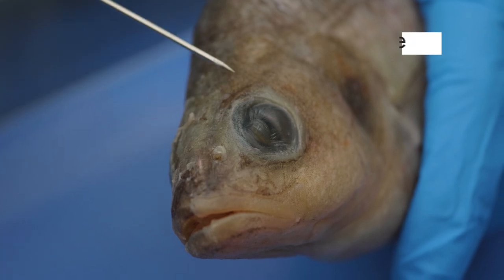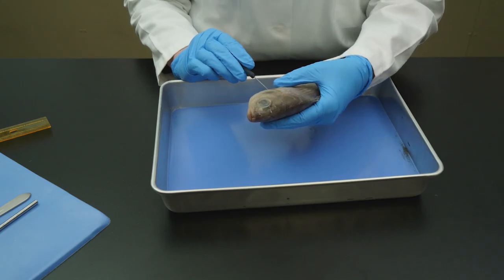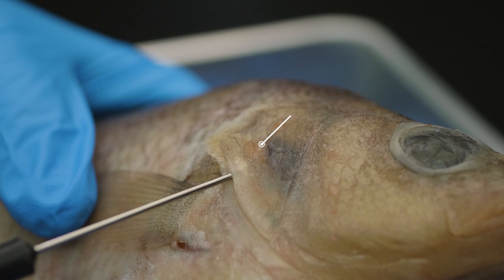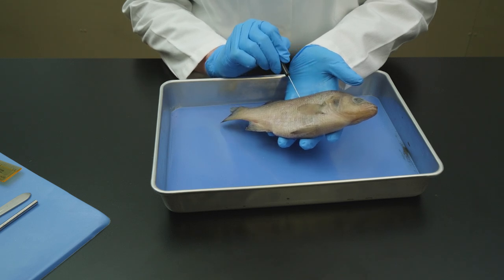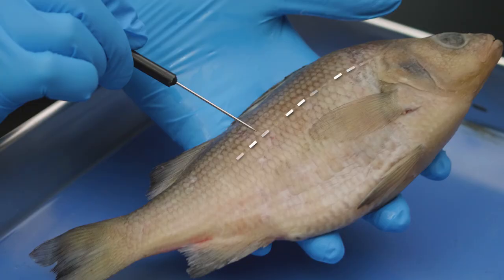Posterior to the nares are the fish's eyes. The perch's eyes have been specially designed to help it see underwater. Posterior to the eyes is a skin-covered bony flap called the operculum. The operculum covers the opening to the gills to protect the gills and to aid the fish in respiration. Behind the operculum is a line that extends to the tail. This is the lateral line, which is a row of sensory receptors a fish uses to detect changes in pressure caused by the presence of other animals in the water.